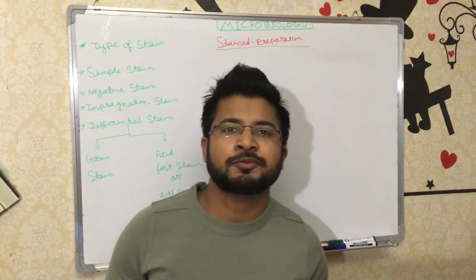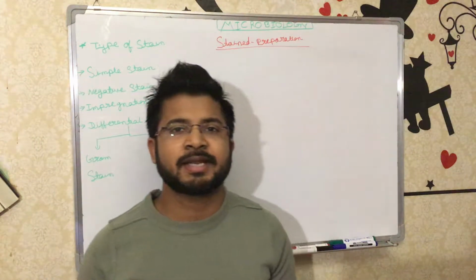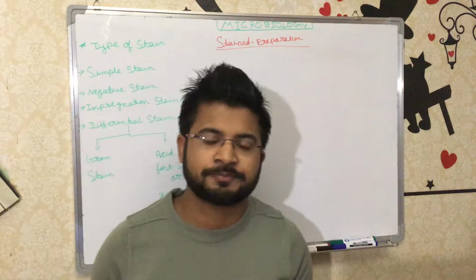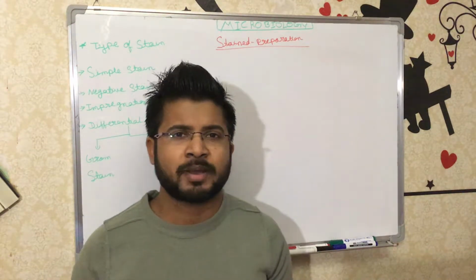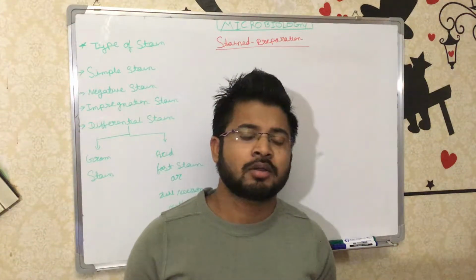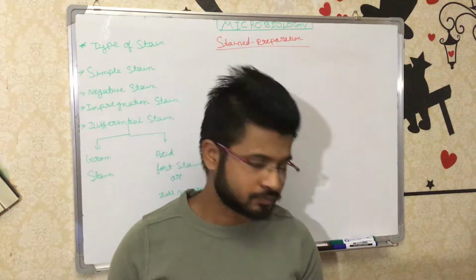Hello friends, this is Sonu, and today we'll discuss a very important topic in microbiology, that is the staining method or stain preparation. First of all, why do we use the staining method in microbiology for the identification of bacteria? Without staining, why can't we identify the bacteria?